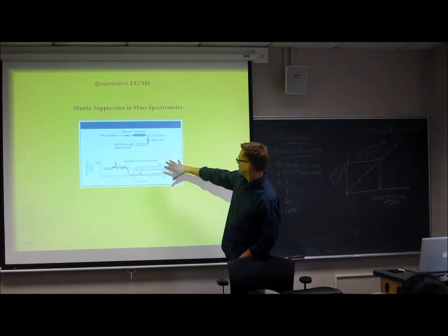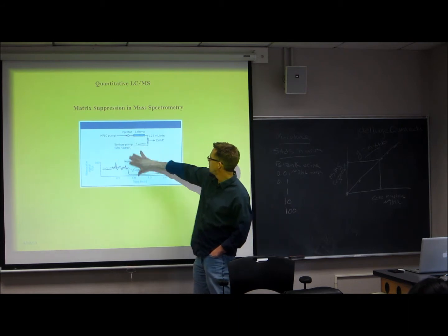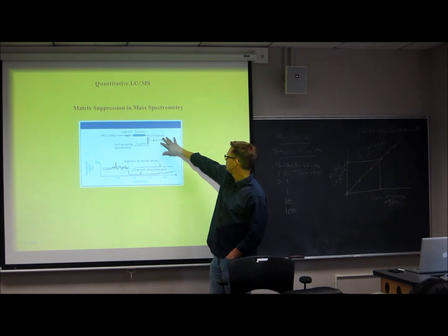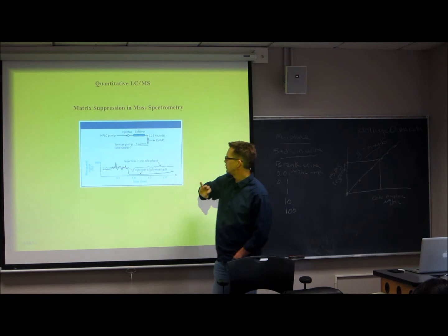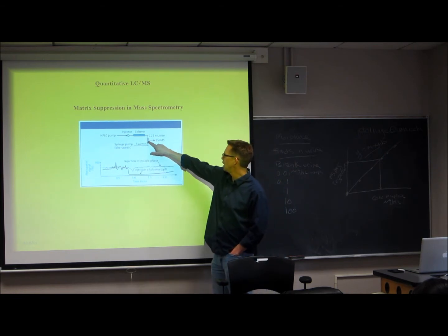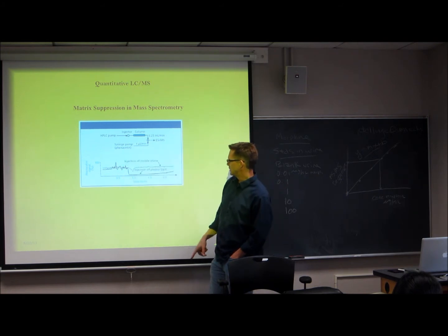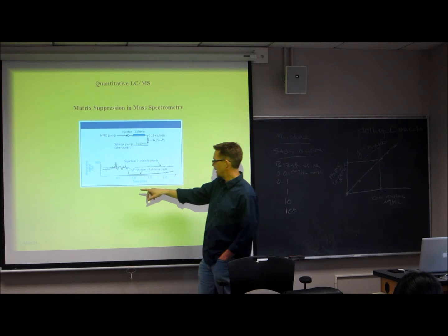So this is a good example of that. What these investigators did was just take an HPLC pump with a flow rate of 0.25 mL per minute into the electrospray, and they did a constant syringe pump injection post-column into the electrospray mass spec of phenacetin, and then monitored that MRM transition specific for phenacetin.